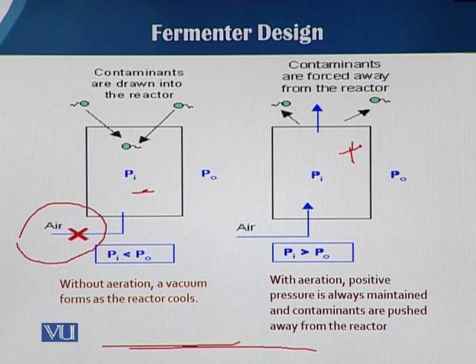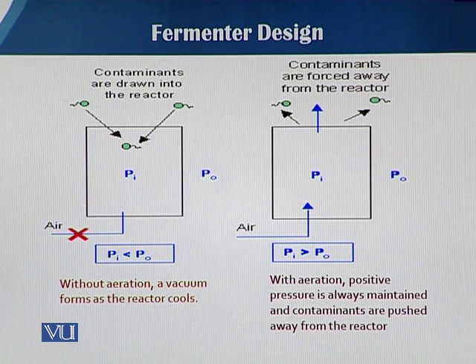So we should always keep the positive pressure, but we must be very careful to keep it only up to a certain limit that the fermentation vessel can withstand, which is most critical for lab scale fermenters, where there is a glass vessel.